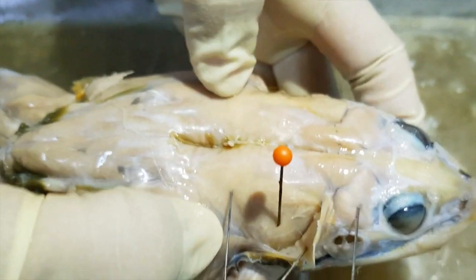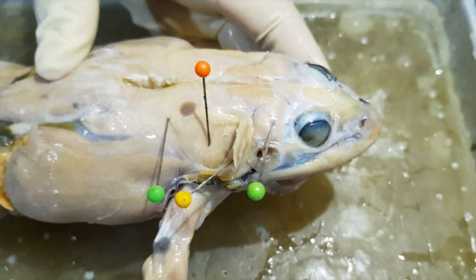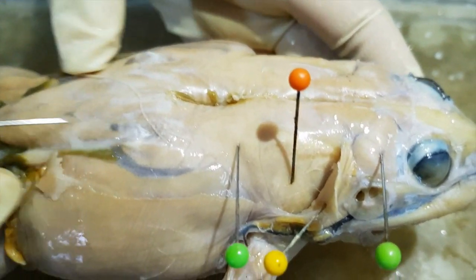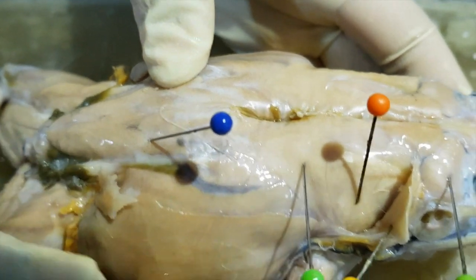It's triangular in shape. And on the side going caudal, this triangular shape that meets at the middle is the coccygeal iliacus.